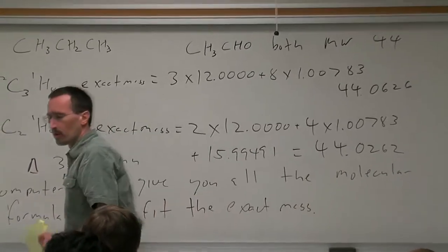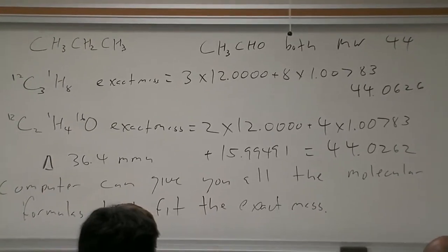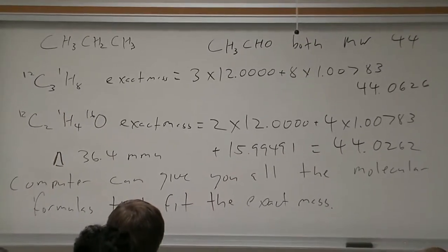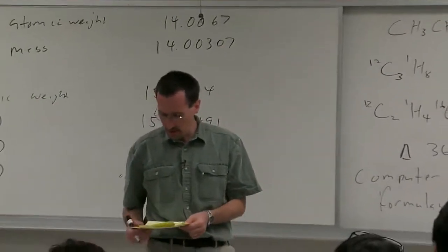So for example, if you go to John Greaves and give him a small molecule that you've synthesized and you get a high-resolution mass spec on it and you get a particular exact mass, he can give you all the molecular formulas that fit within 5 or 10 millimass units.